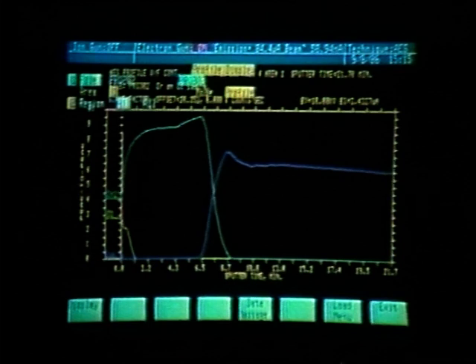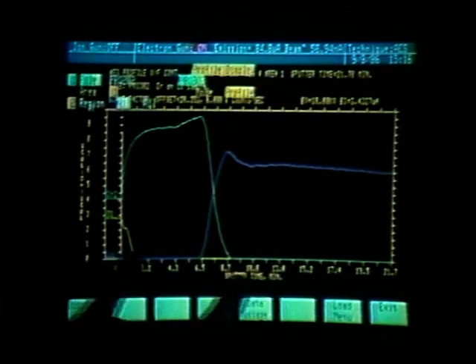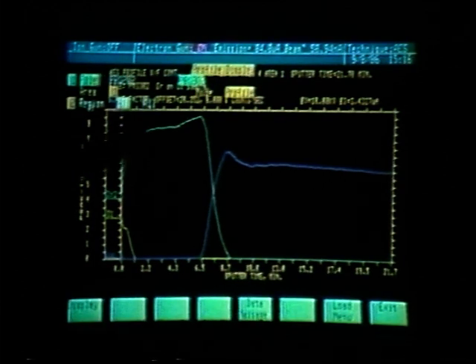Since we cannot display windows, we do not have sensitivity factors for N of E data, so we cannot obtain an atomic concentration of this profile. So essentially, what we see in the peak-to-peak profile display is the only information that we can get from a 2-point profile.